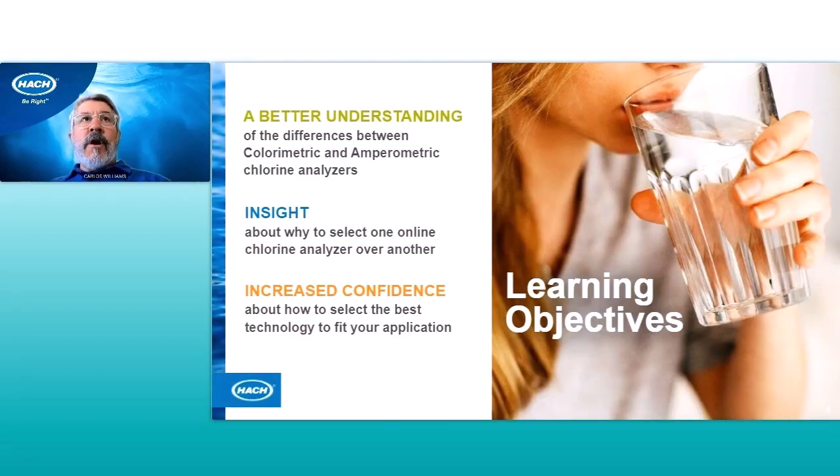So what we'll talk about in this short video is a better understanding of the differences between these two styles of analyzer, the colorimetric and amperometric chlorine analyzers, and about why to select one type of analyzer over the other, and ideally to give you some increased confidence about how to pick the right type of analyzer for your application.